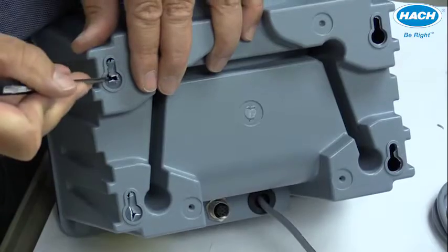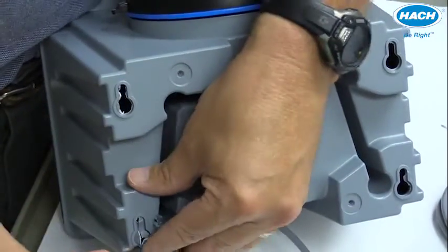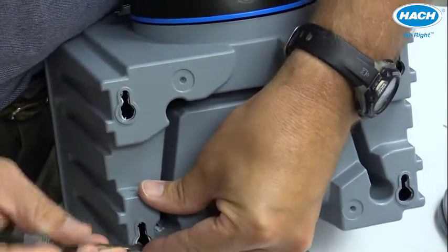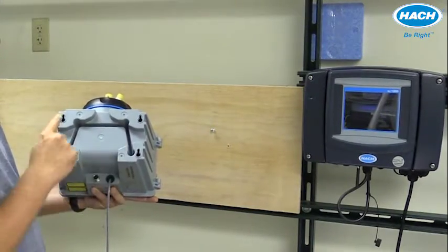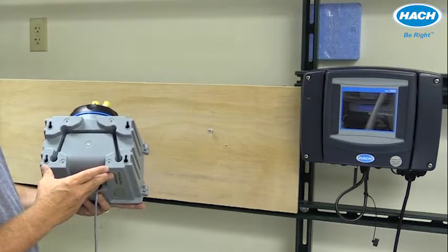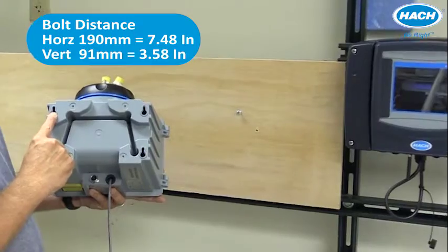You can use the small screwdriver to remove the excess material from the hole. Four bolts are needed to hold the back of the process instrument if the mounting bracket is not used. These bolts should be mounted level and a certain distance apart — 7.48 inches or 190 millimeters apart horizontally.